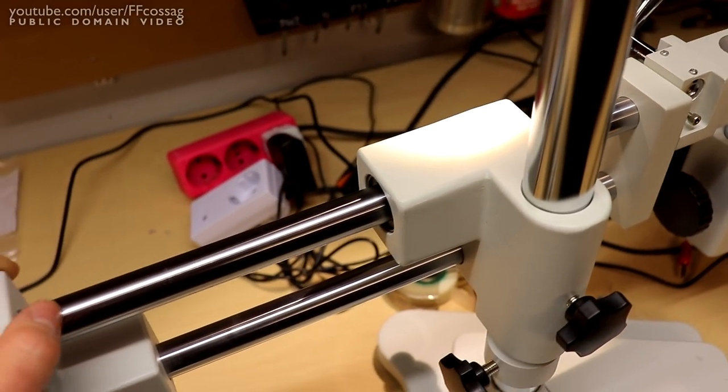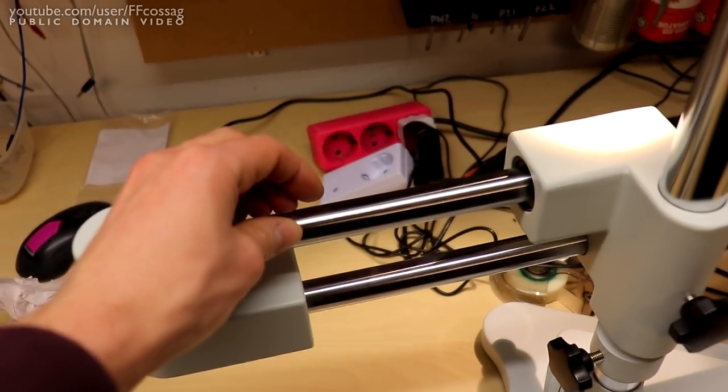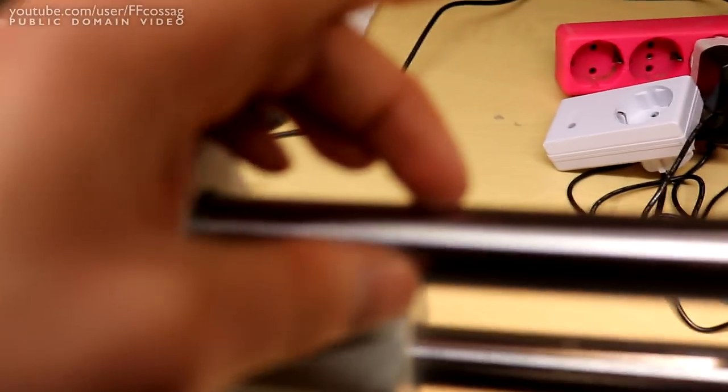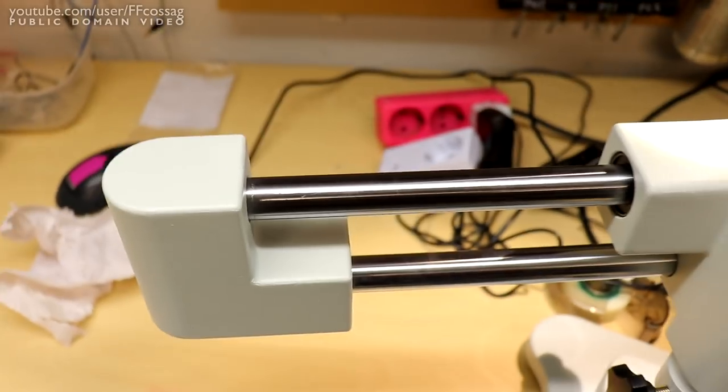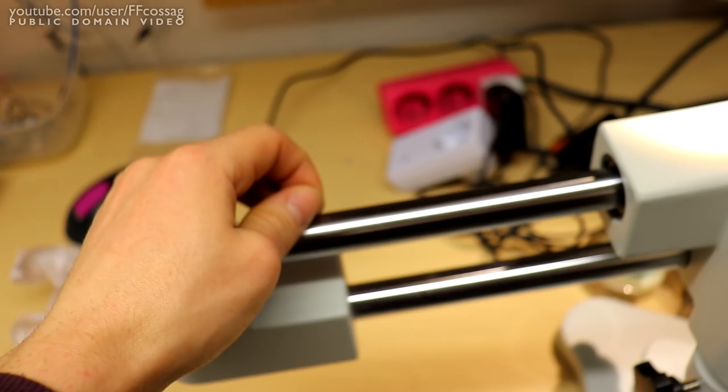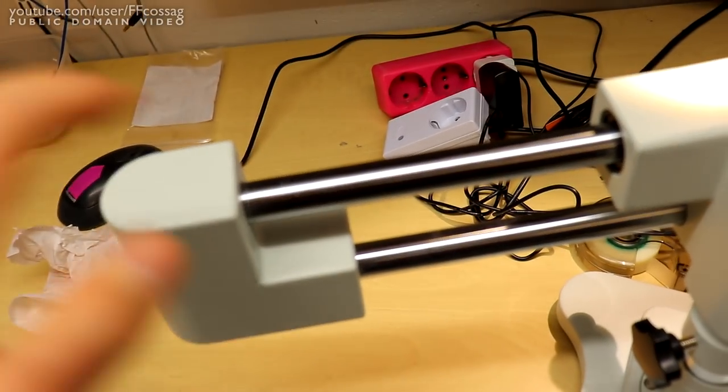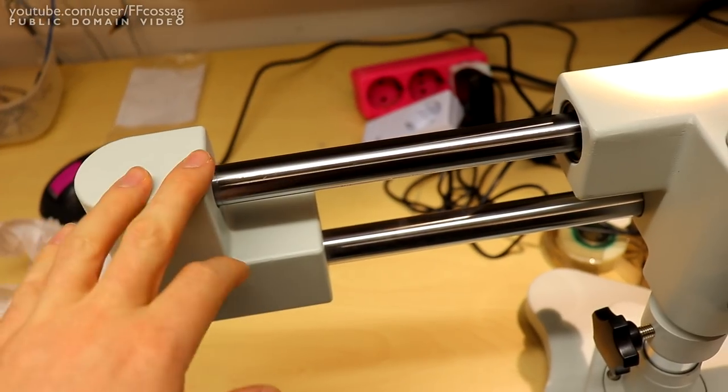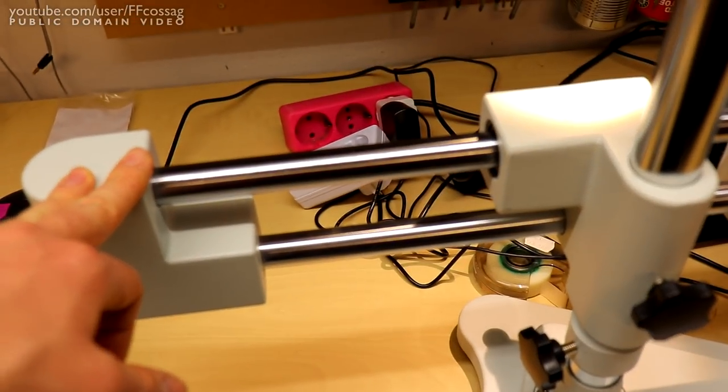So I'm just not going to use this. I don't want to ruin my new arm. Just listen, I'll bring the mic up close. I hope you heard that. I can hear my nail scraping over that deepening gouge in the hardened steel arm. That's disappointing.